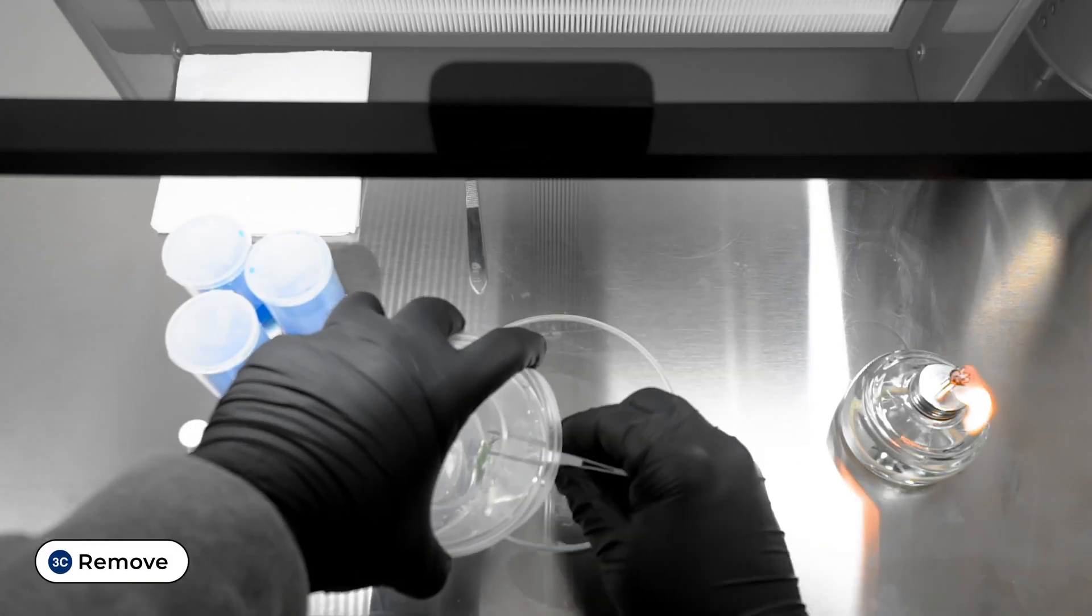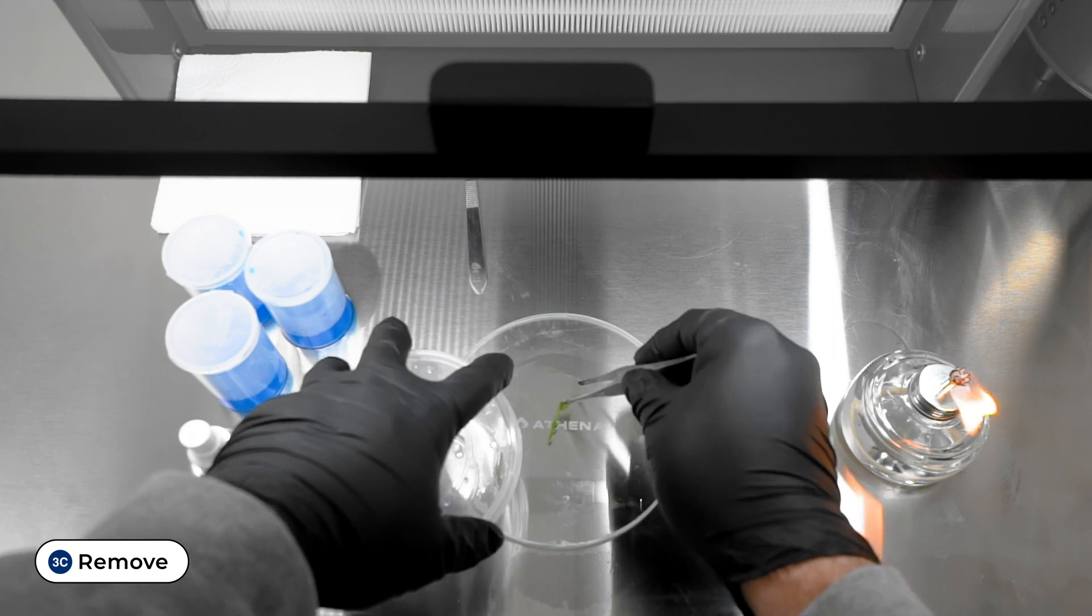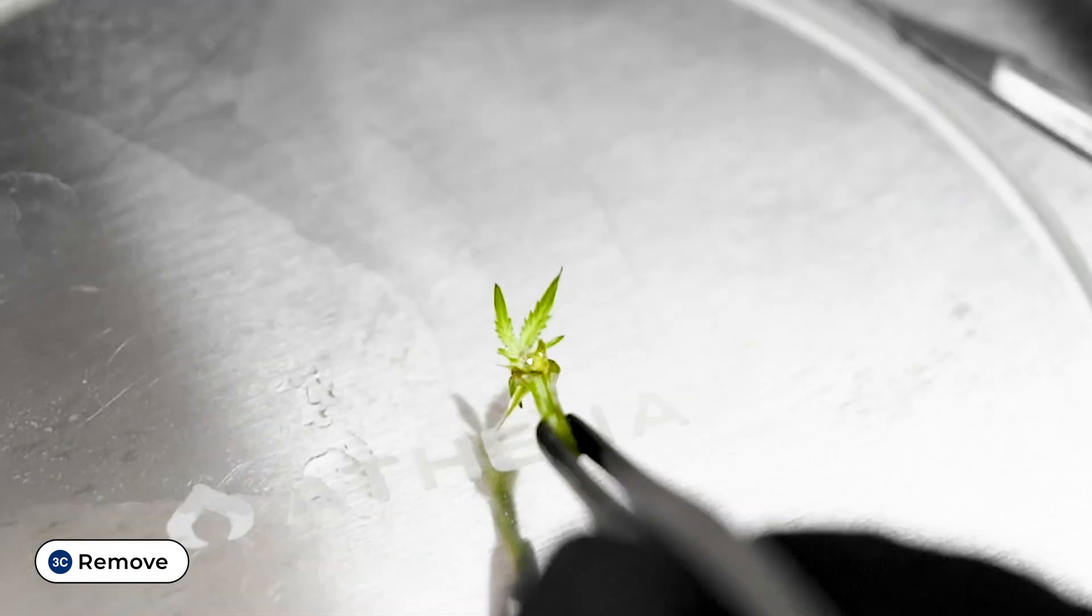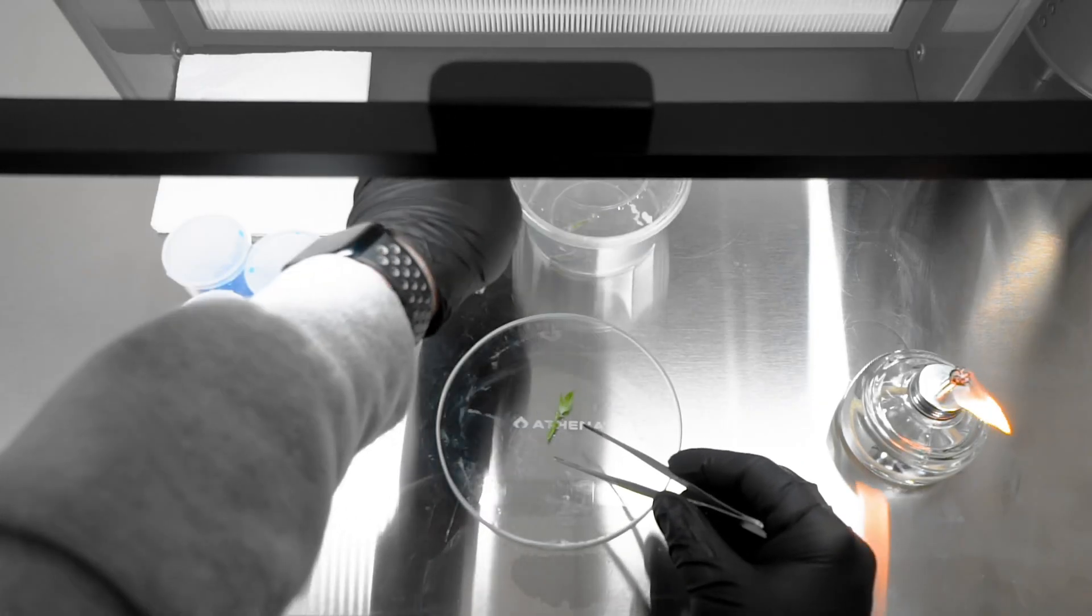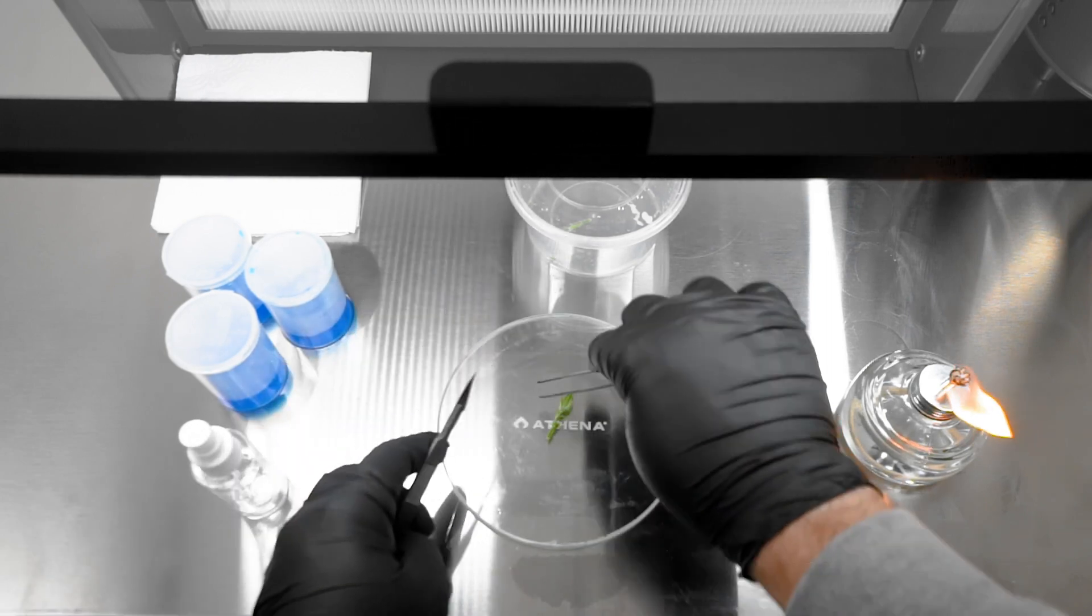Slightly open the utility vessel with the washed cuttings. Using the sterilized forceps, pull one node out at a time and place it on the sterile work surface. This is done in the flow work zone.